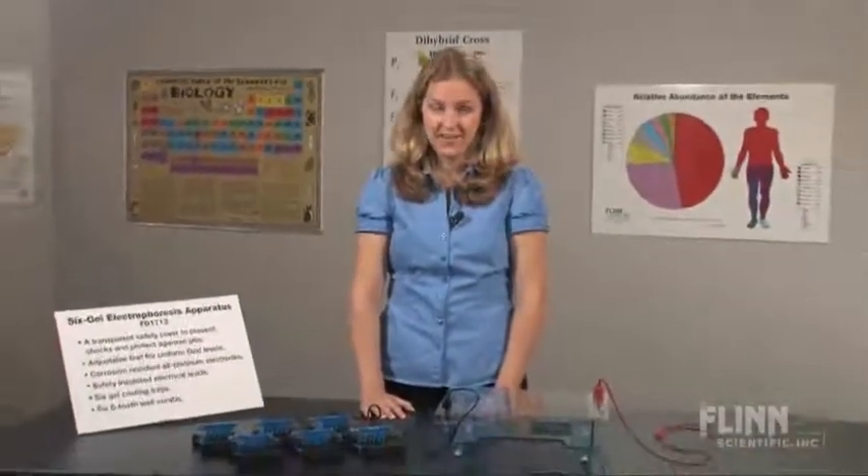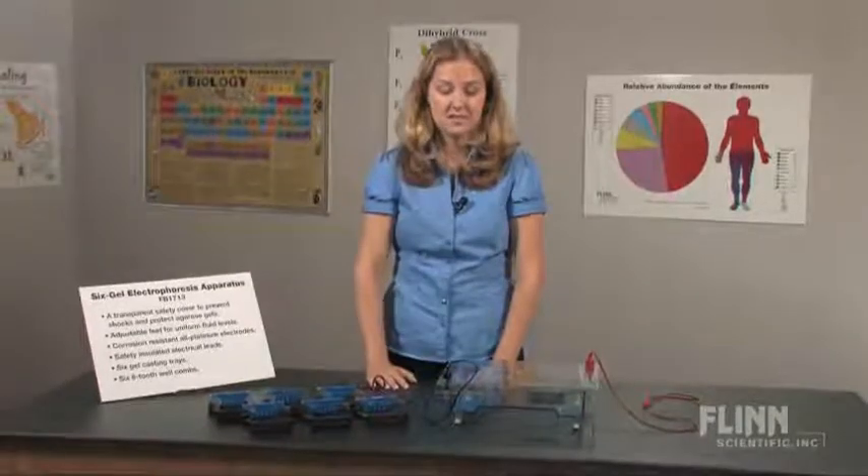Save time and money by running the entire class's samples at once using the Flinn Scientific six-gel electrophoresis apparatus. It's safe and simple to use.